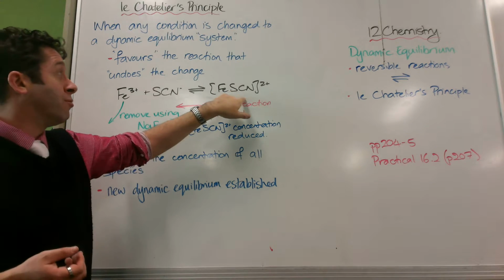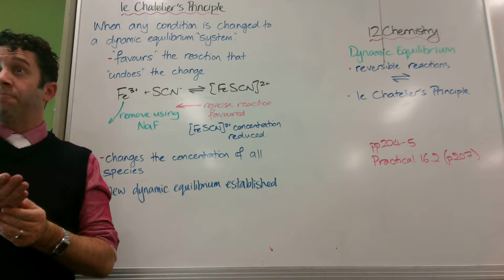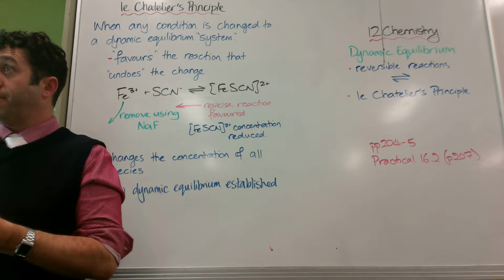And because this is blood red in colour, it got darker and darker and darker. For some of you it went nearly black. It added so much that it went nearly black.